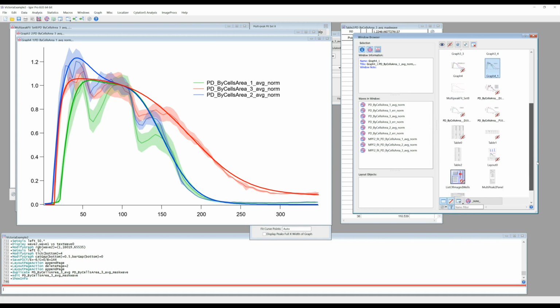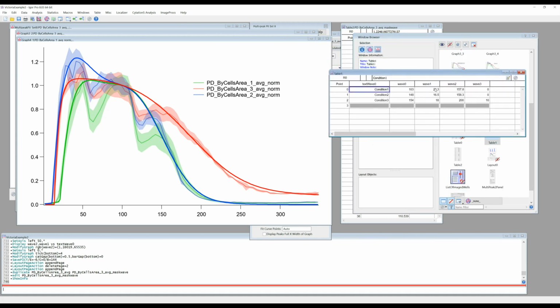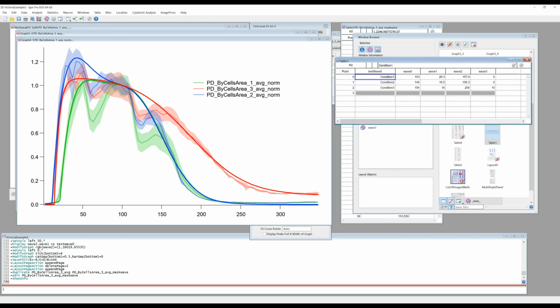We actually do have those numbers. Well, you need to reformat this a little bit. So for presentation, present these quantitative numbers in a table and then the graph in a normalized way so that it's very easy to follow. And I normalized it to that 100-minute time point, which I called puncta density value at steady stress state.